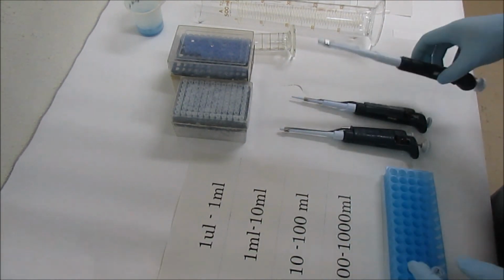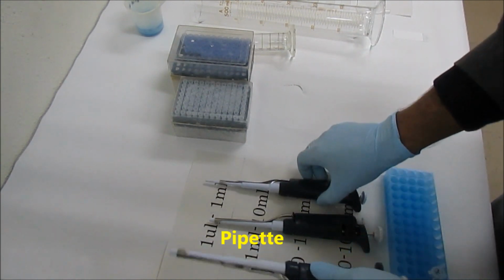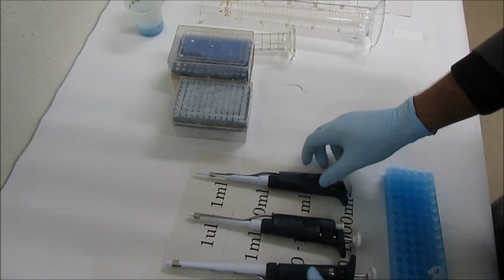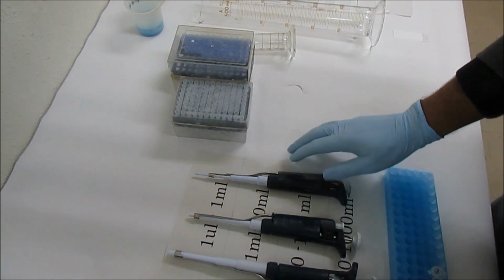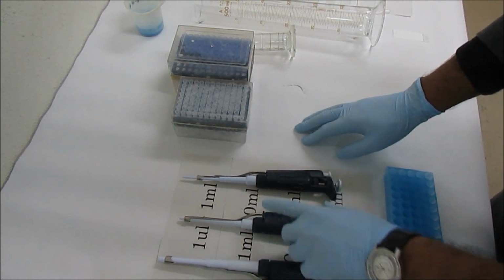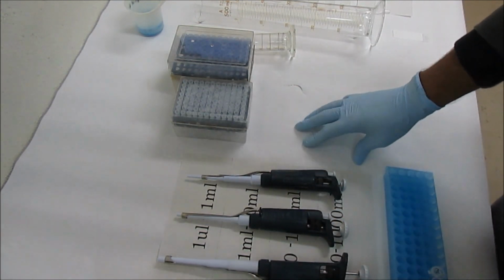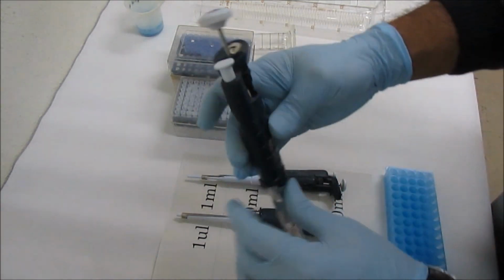In the laboratory we use a tool that we call pipettes. This is how it looks. This is a set of pipettes. They have different ranges, and later I am going to tell you how they are different and how to measure different ranges of liquids.